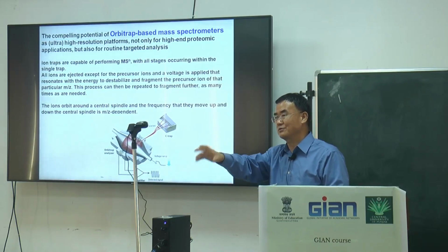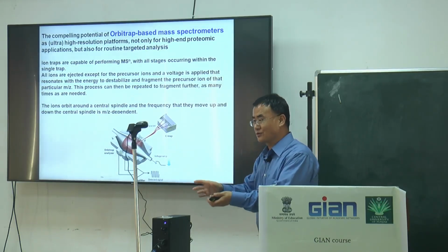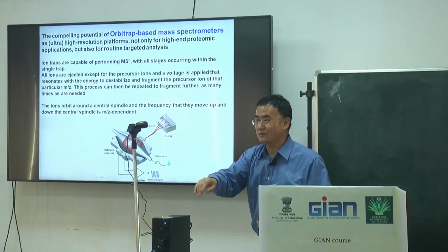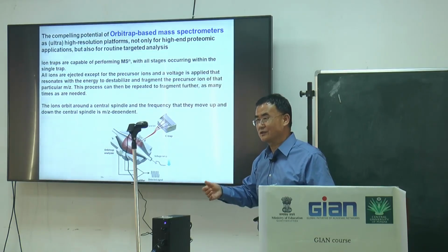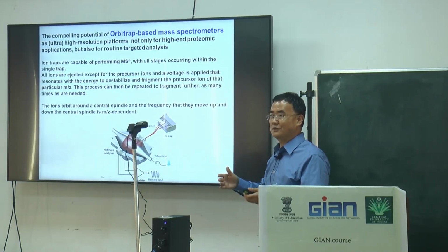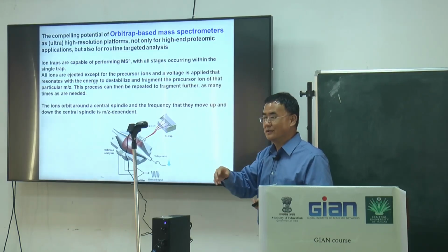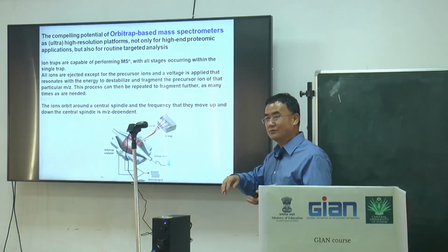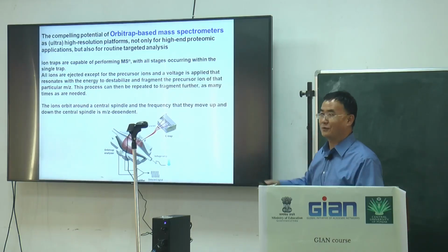Or sometimes you put the protein there and use the protein as a way to trap other molecules, to find all the molecules that can bind to the protein. Doesn't matter whether it is under physiological conditions. Sometimes, because we extract the plant and then do in vitro binding, it doesn't mean they really bind in the cell. But this at least indicates one way of advanced study.